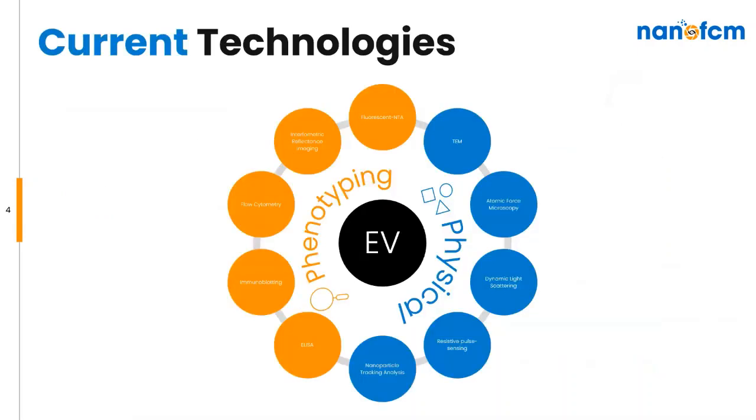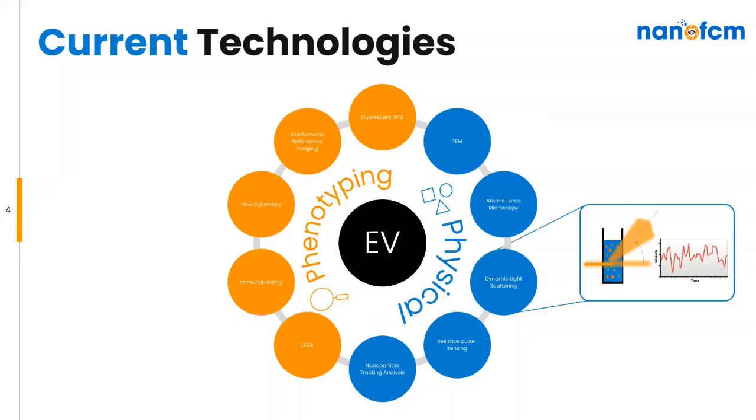So before delving into our nanoflow cytometry platform, I wanted to start with an overview of different technologies applicable to nanoparticle analysis. This will help highlight the need for our platform and the position that it fills. On this slide, I'm sure you can identify a number of bulk analysis techniques such as ELISA, immunoblotting, and dynamic light scattering. However, to keep pace with the direction that modern therapeutics and diagnostics are heading, bulk analysis techniques are not enough. Single particle analysis is essential to answer crucial questions about your particles.